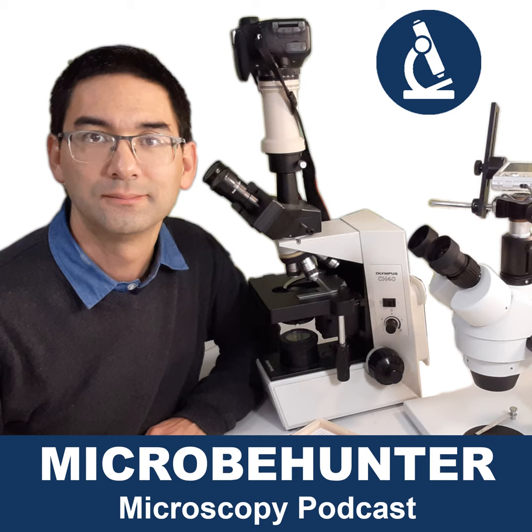So ultimately, as I said, you're probably going to get both. However, for your first investment you probably do not want to spend too much money, so you have to make a decision, right? And I'm going to make it easy for you. If you don't know what to observe, or in which direction the hobby is going to take you, I would probably recommend that you buy yourself a compound microscope, simply because it's a little bit more difficult to use, and so there is more that you can learn on that.